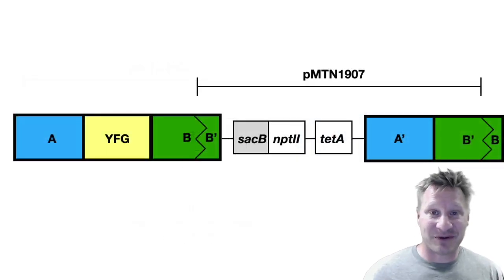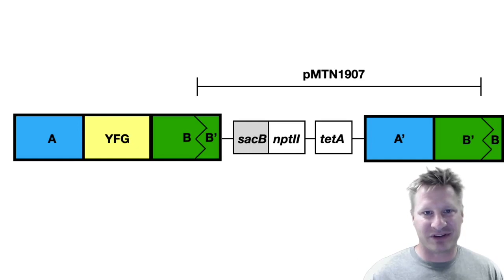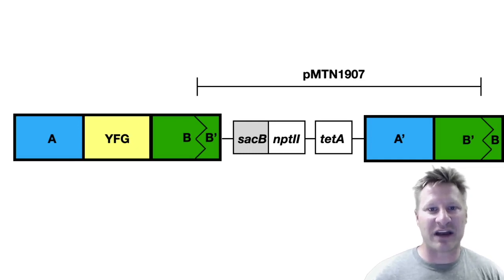All right, like I mentioned before, the plasmid, when it integrates into the genome, can integrate in a couple different ways. Before we showed it where it kind of broke up the A regions of the genome, the A brackets of the genome. Now I've just shown you an orientation here where the plasmid is integrated into the B regions of the genome. Same deal, it can go in through recombination in any of the similar sequence tracts that we've provided for it with the A prime and the B prime sequences. But in this case, the plasmid's gone in and B prime is recombined with B, and it's just kind of flipped around the orientation of things. But this construct will work just fine for generating deletions too. We basically just want to select for the tetracycline resistance to get it into the cells, into the chromosome, and then we're just hoping to flip it out in the right way.